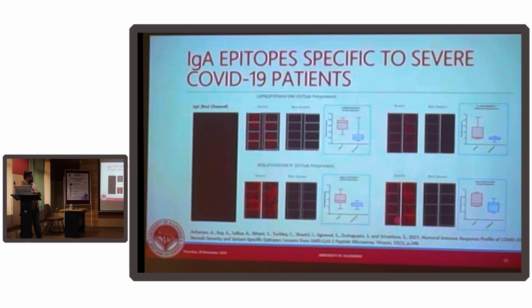So this is what the grid of IgA used to look like. Now you see, this paper is already published, in 2023. So this was what the scan looked like. Now if you look very carefully, you will see the entire slide is not stained red. You can see small dots, right? So these are all double spots, and when you zoom in further, this is the overlay of the grid.